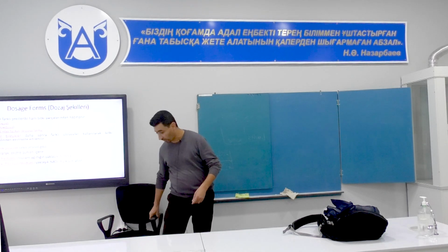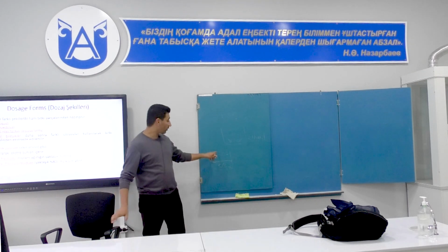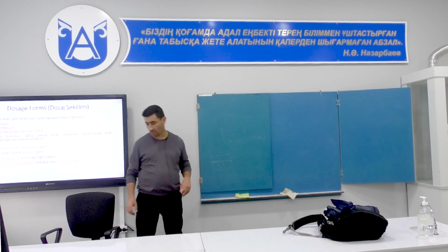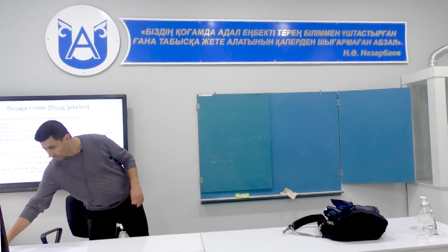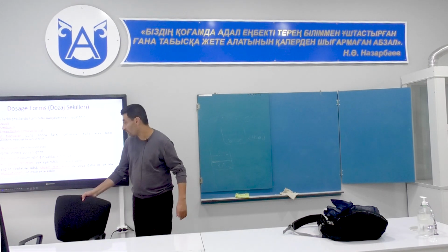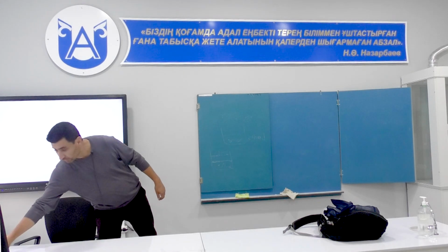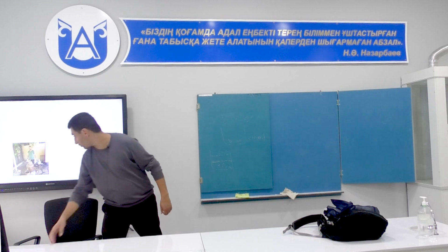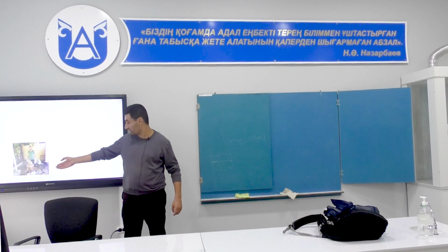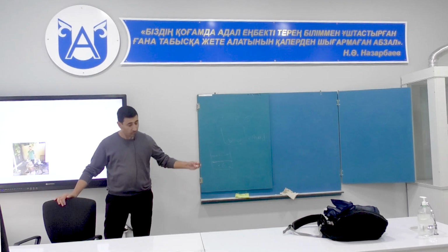Generally, in this extract, the soluble fraction is 20%, and this is 80%. That's not dissolved, okay? This part is not important, but the important part for us is this one. Also, we have some volatile oils. Let me show you one of the methods we use in Turkey for extraction of oils. This is called imbik. Imbik, it's a traditional way.